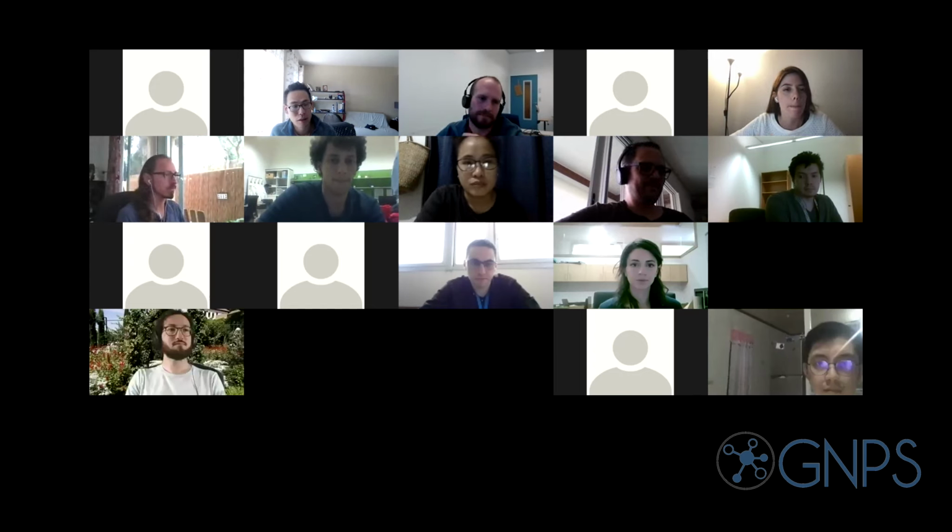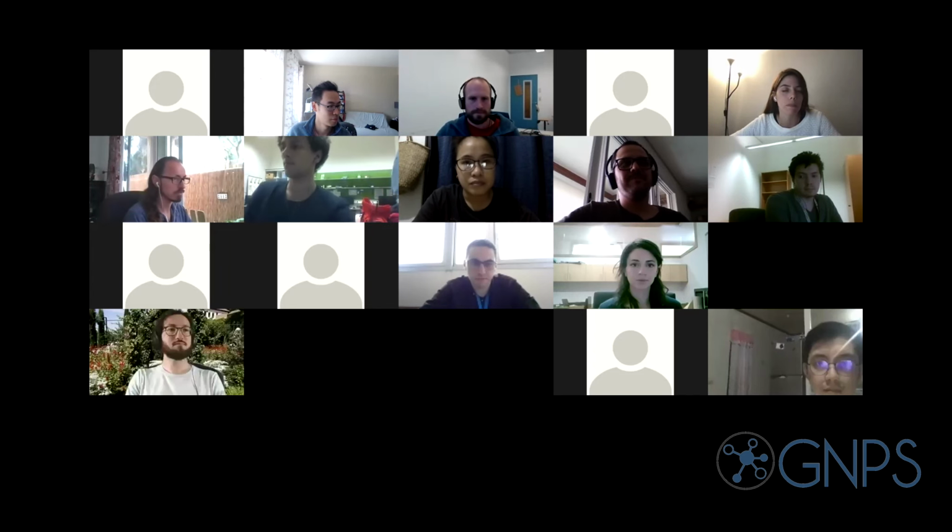Yeah, I should probably, because I'm using the GUI and the command line, and I'm getting different results. So I should probably talk to them. They haven't updated it for many years either. Correct. Because there's no active funding for it. Anyway, I'll email them. Also, for those of you who want to contribute, there's not much active funding for GNPS Dashboard either. So if you have an idea, we can work together.